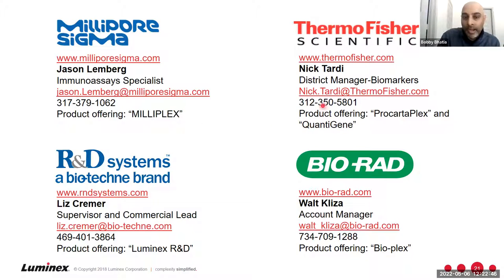All four companies offer proteomic applications, so everything from immunology, inflammation, to cell signaling, to endocrinology, and so forth. I would say that Thermo Fisher is probably the only company that offers genomic nucleic acid targets that are ready to go for you. There are other companies that do histone modifications that you can also look into. But I would say that these are the four companies, and they do custom design your assay.